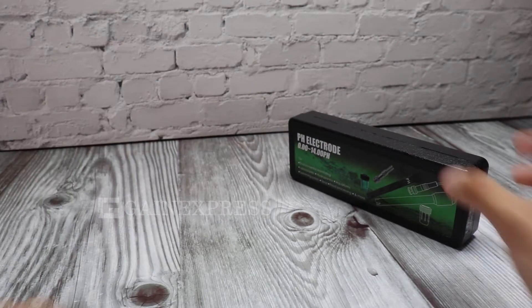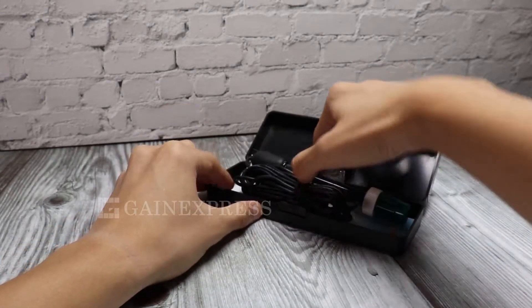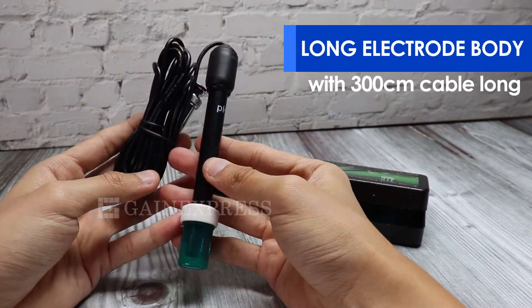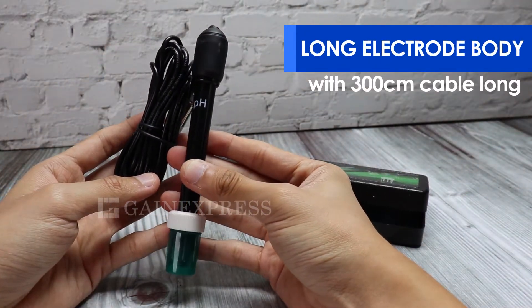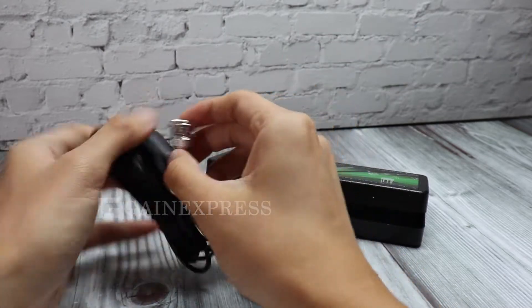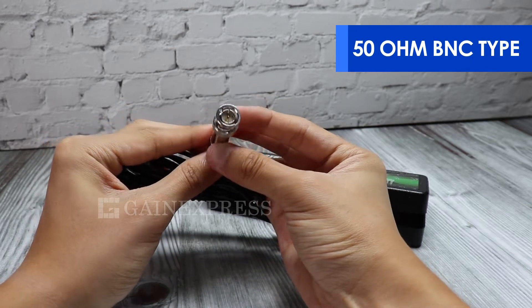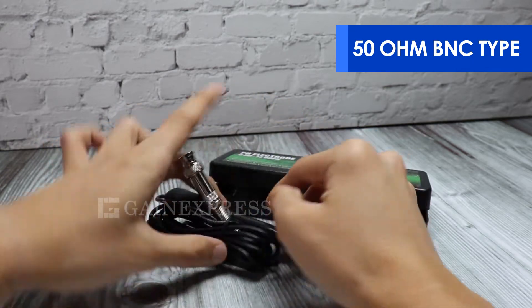E1325M PH Electrode. This PH electrode has a long electrode body with a 300cm cable. Its 50 ohm BNC type socket allows you to connect directly into the BNC input terminal of any PH device.